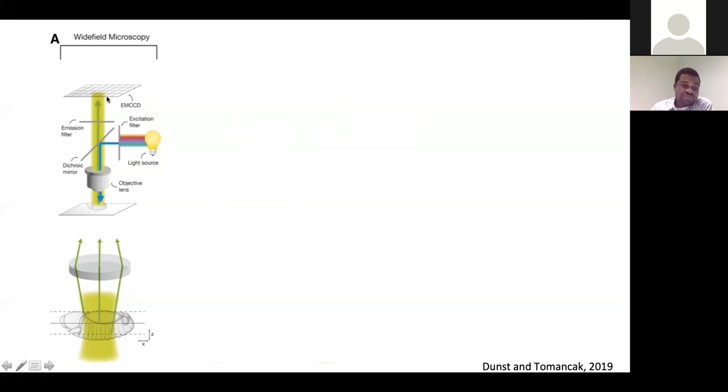The out of focus scattering is all collected through your objective and detected on your camera. So in a widefield process, your major issue becomes the out of focus scattering that we capture on the detector. However, if your sample is very close to the cover slip and it is a very thin slice, you are more likely to capture a very good focal plane right at the cover slip. And that is something you would have to consider.